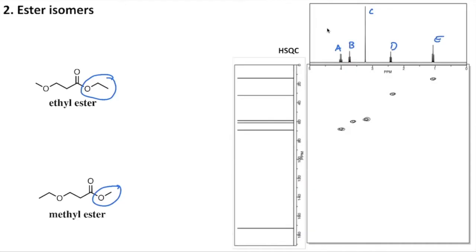So we have 5 different types of hydrogen identities on our molecules, and let's just draw in some tick marks on both of these to make sure that adds up. So we have this methoxy group here, that's all one type of hydrogen. Then we have another type here, 2, that's 3, and then 4 and 5.